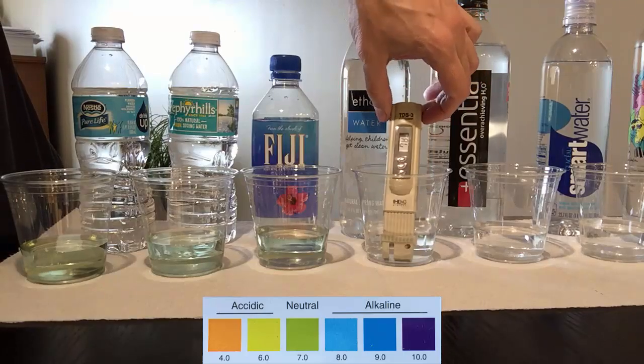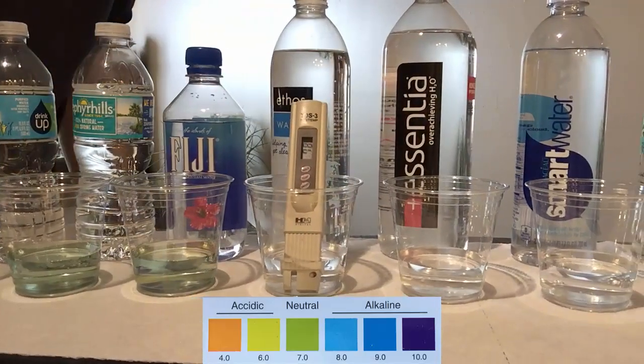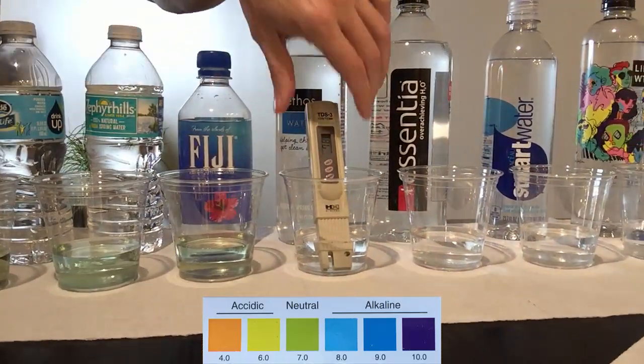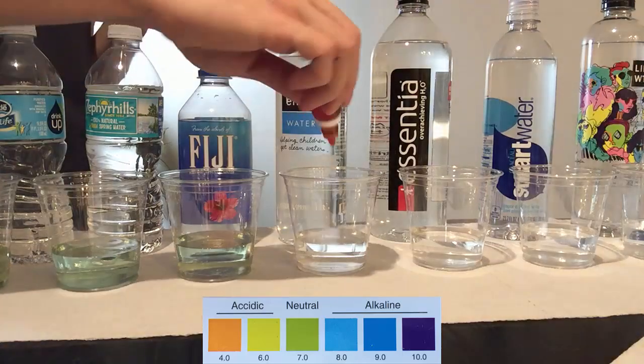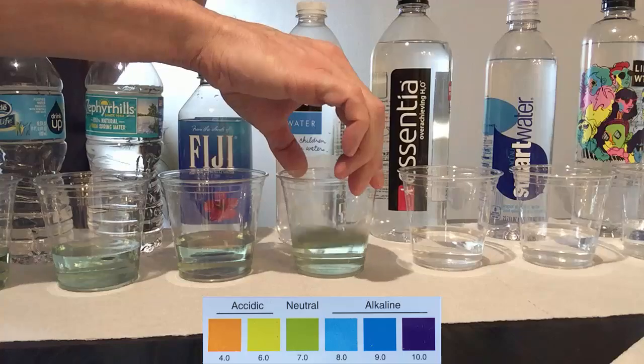Ethos is the water that can be found in Starbucks, with a TDS at 78. This water comes from natural springs in Tennessee, and the pH of this water is slightly alkaline.